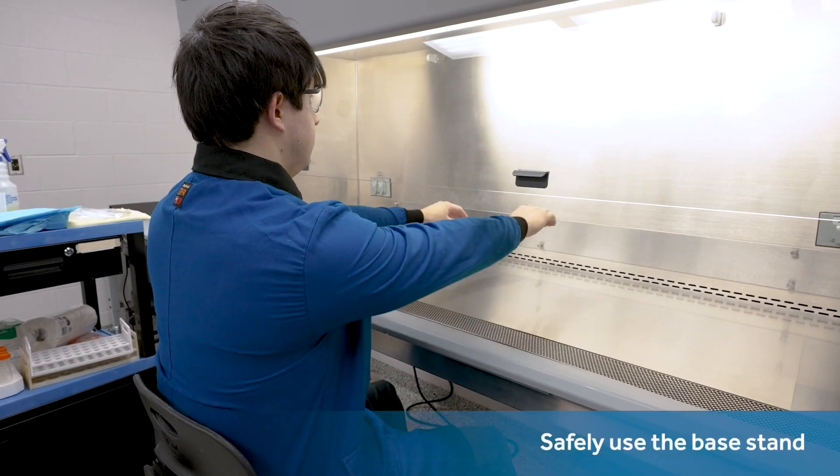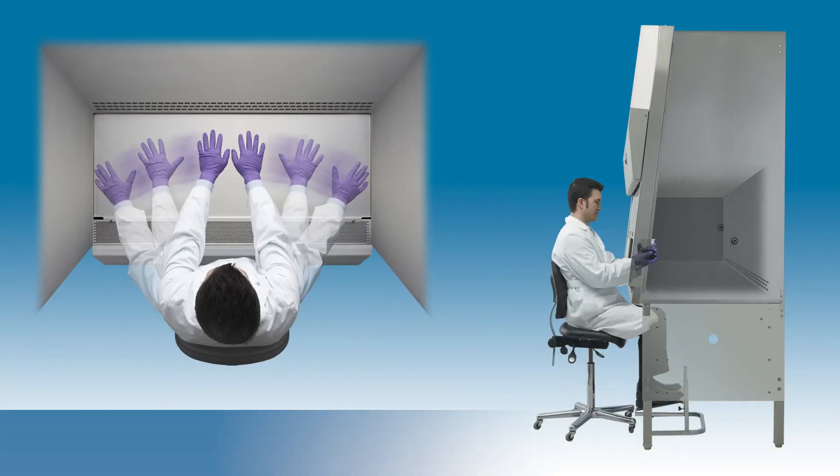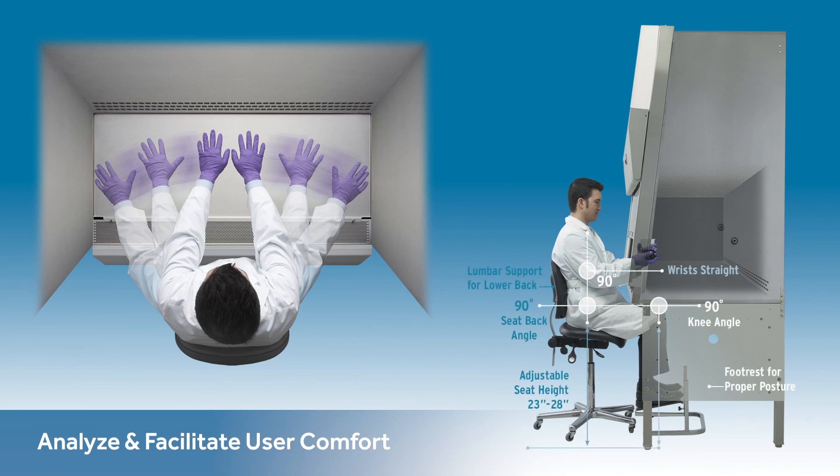Industry standards advise setting the base stand no taller than what the producer is required to indicate as the tallest setting that will keep the biosafety cabinet from tipping over. One industry standard suggests that every operator's manner of carrying out their task in the cabinet be analyzed, considering points such as how the inside of the cabinet is arranged, how the operator best positions their body, and how well they can see. A place to sit that can be configured along six different axes and promotes the right positioning of the operator's body by tailoring its vertical and horizontal components is among the items that can assist the operator. One is advised to make the right modifications to where the operator sits in order to sustain their spine.